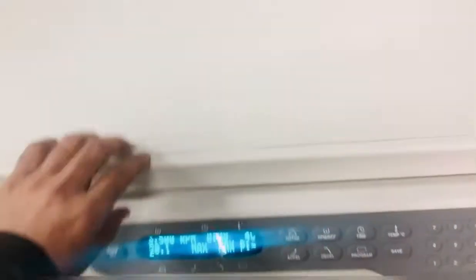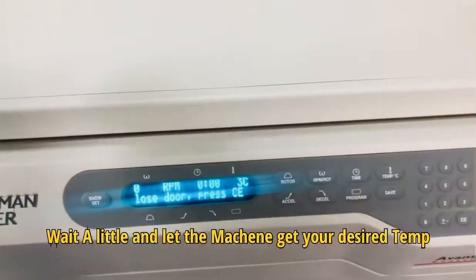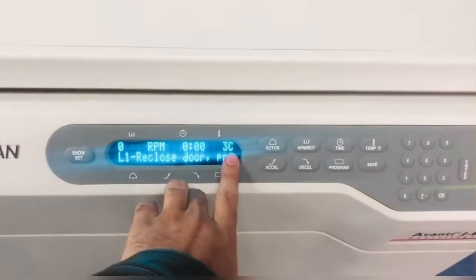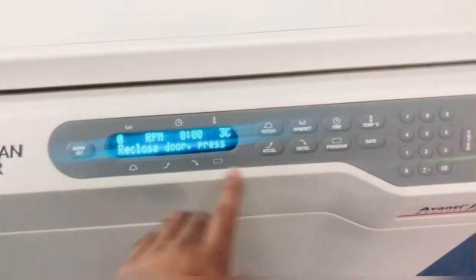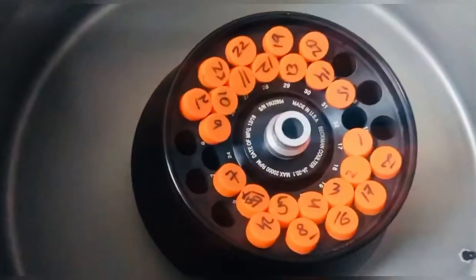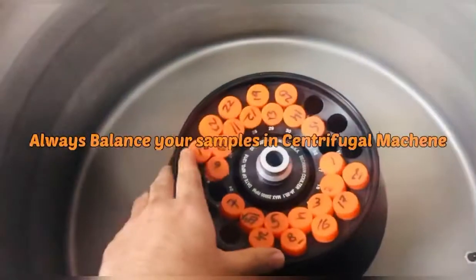After setting the temperature, let the machine maintain the temperature you have desired. The temperature the machine is showing is the actual temperature the machine currently has. After that you can load your samples. I have already loaded my samples — here are my 24 samples. Please don't forget to balance them. Balancing samples is very necessary.